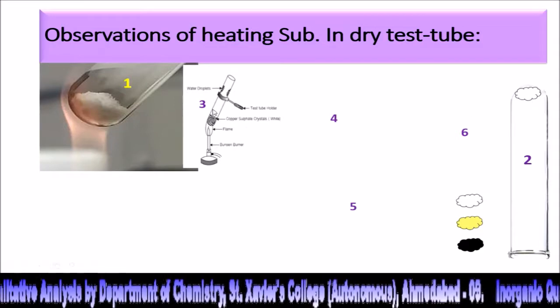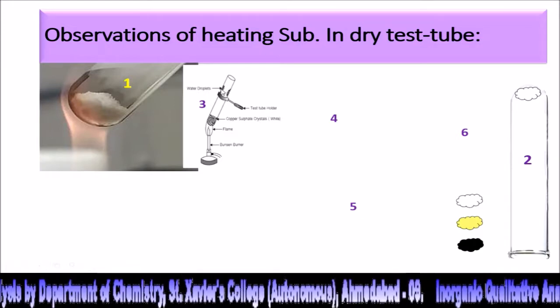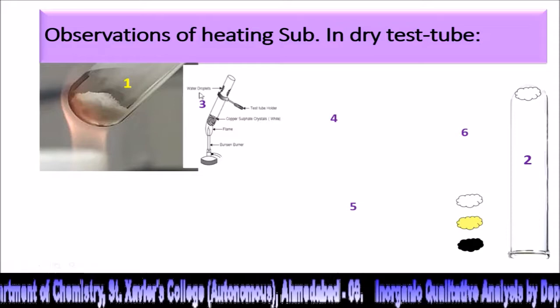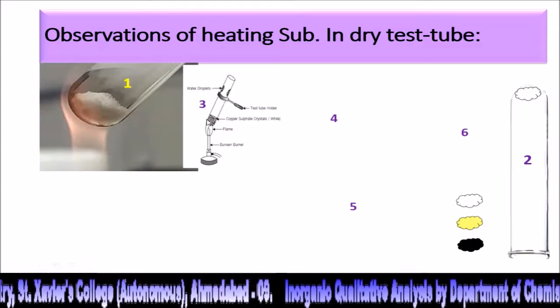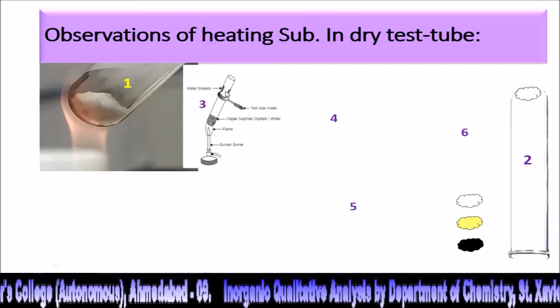Observation 3. Water deposit on the cooler part of the test tube. On heating the compound, if water droplets come at the cooler part of the test tube, you may say hydrated salts are present, and the crystal water will deposit over here. So mostly crystalline substances on heating give you water droplets at the cooler part of the test tube.